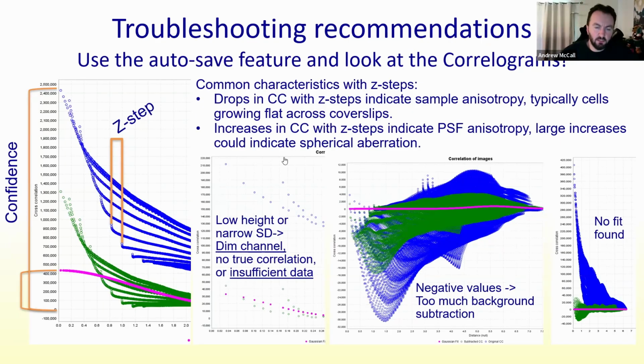Yeah, so you will get a slight broadening of the error measure, the standard deviation, right? A little bit. It's actually not affected too much, and you can actually see that. I'm not going to go back. Puncta, yeah, makes sense.